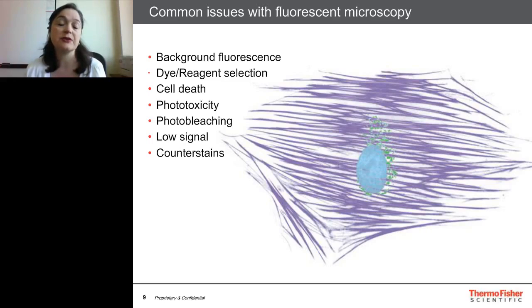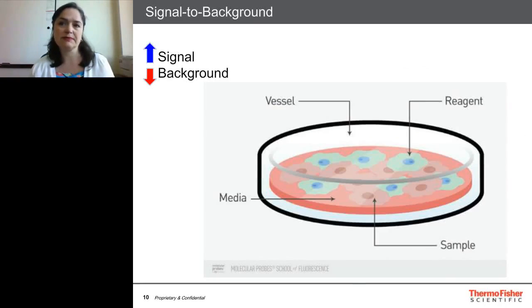And then there's also issues of phototoxicity. We're going to explain what phototoxicity is and some ways to avoid it. Same with photobleaching and other common problems.